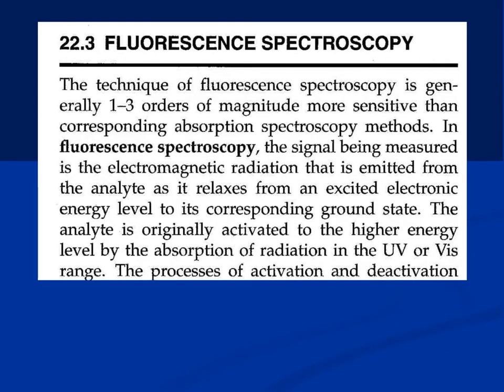The other part I discussed a little bit is fluorescence spectroscopy. I told you that the antioxidant capacity ORAC determination is by fluorescence, and there are other methods which require fluorescence spectroscopy to be used. It's very similar to UV, and as I discussed with you, I'll discuss it again here a little bit. It is similar to a UV spectrophotometer, but it's very sensitive.